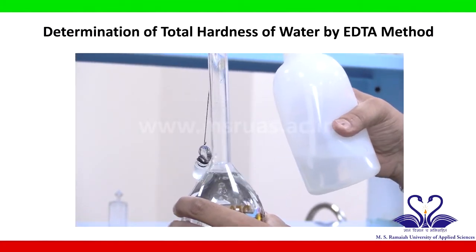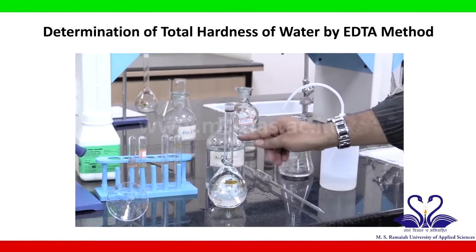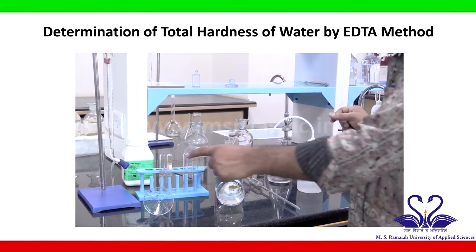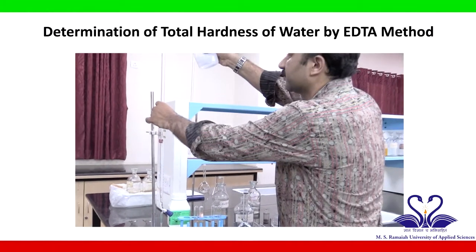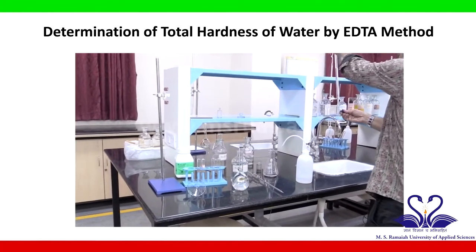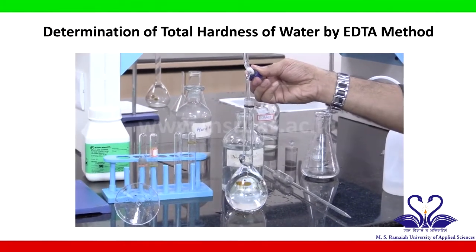The remaining small quantity, whatever we want, we can add using this burette. The burette is already washed and rinsed with distilled water, so we can take some quantity of water in this. We can add slowly from the edges.